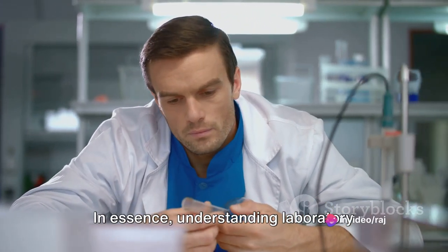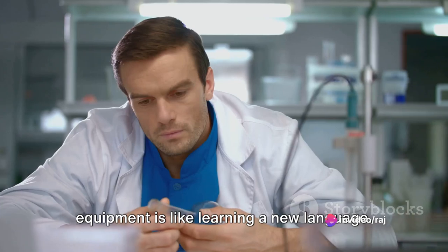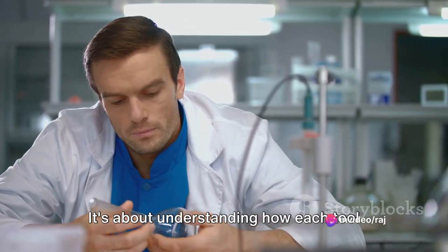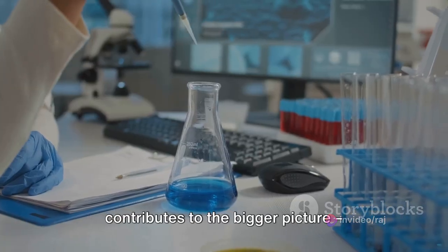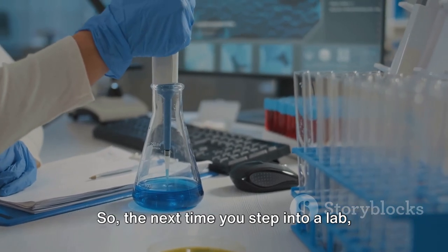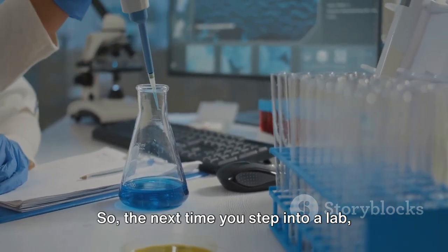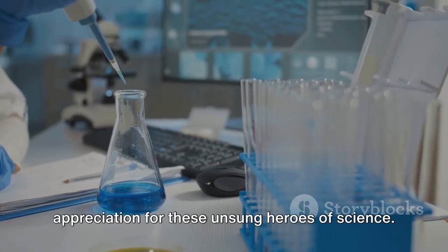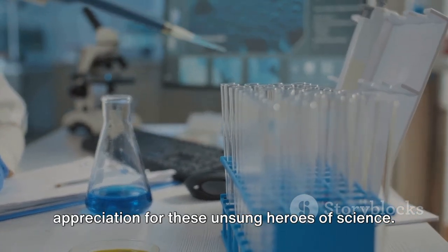In essence, understanding laboratory equipment is like learning a new language. It's about understanding how each tool contributes to the bigger picture, facilitating scientific discovery and innovation. So, the next time you step into a lab, you'll carry with you a deeper appreciation for these unsung heroes of science.